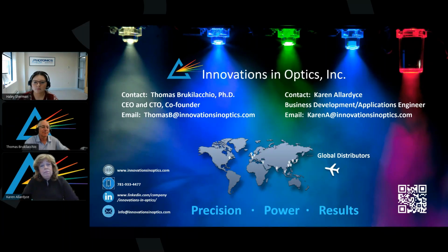LEDs can compensate for it to a certain extent by using multi-dye arrays. We do efficient optical coupling, synchronization with image sensors, etc. And in some biological imaging systems, the critical parameter is not the peak brightness of the source anyway. It's the number of useful photons collected during the camera exposure window. So it's not as stringent requirement to use xenon for the pulsed illumination. So that's one reason LEDs have continued to successfully replace xenon in a lot of applications. But you know, xenon has its place. There are certain applications where it's warranted.